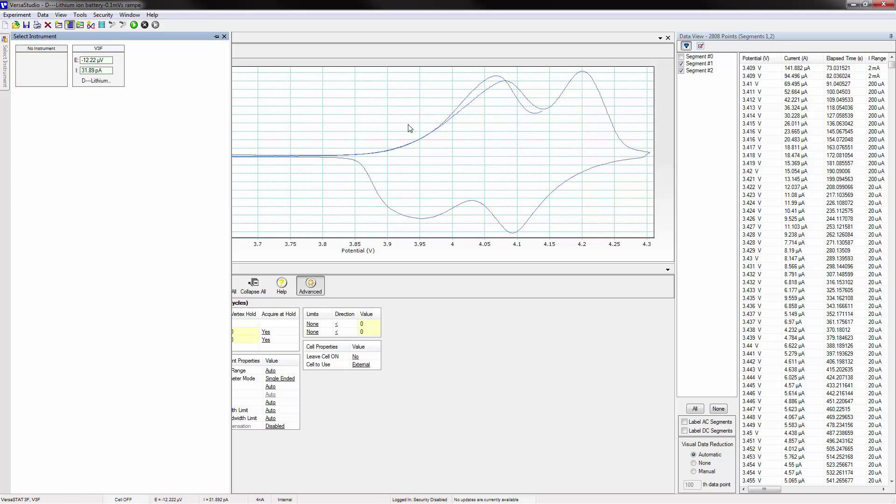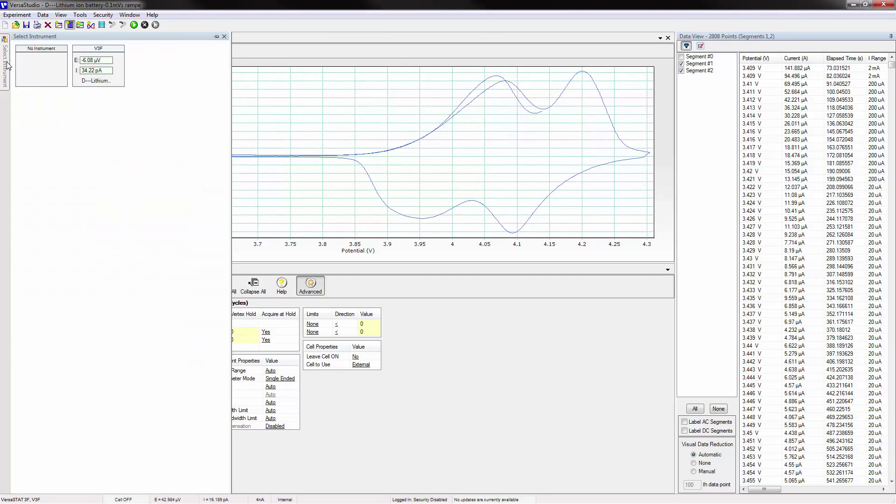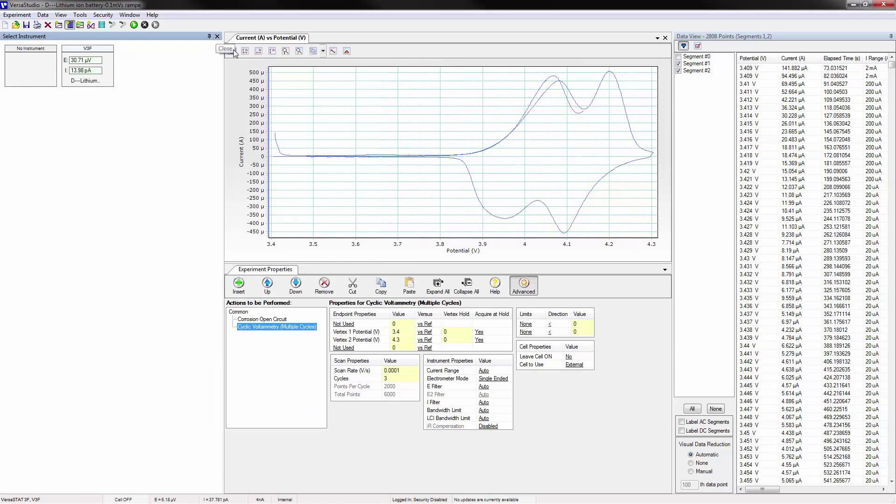Moving the mouse to another area of Versus Studio causes the window to auto-hide. Some users may prefer that this window be visible at all times. This can be accomplished by clicking on the pin icon in the top right-hand corner. Once the window is pinned, it can be resized.